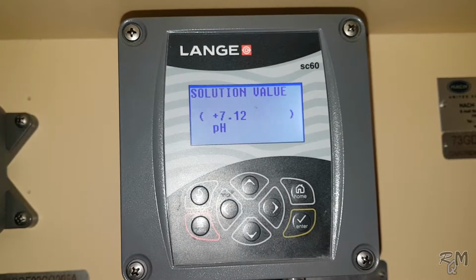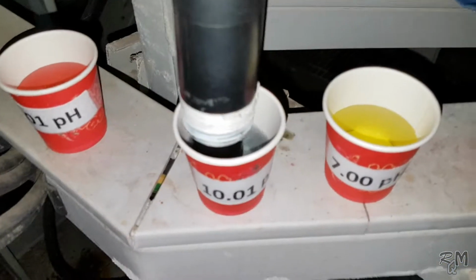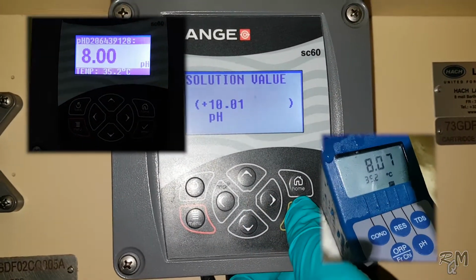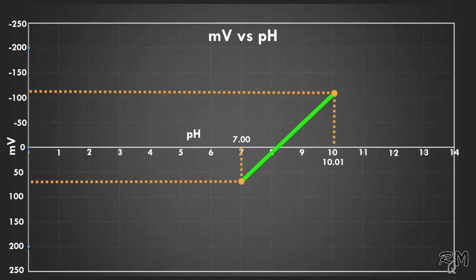In fact, it is a deep discussion and needs time to explain, but in this video I am going to focus on process calibration or process adjustment of online pH analyzer. Regarding the deviation issue between online pH and standard lab pH meter, I will discuss in a separate video. For the time being, keep in mind that in online pH analyzer, slope is generated by using 2 buffer solutions, whereas standard lab pH meter utilizes 3 buffer solutions to generate slope. Mostly slope values of both are same, but sometimes there is deviation in points position of slope. This difference of point position creates small deviation between online pH analyzer reading and standard lab pH meter reading.